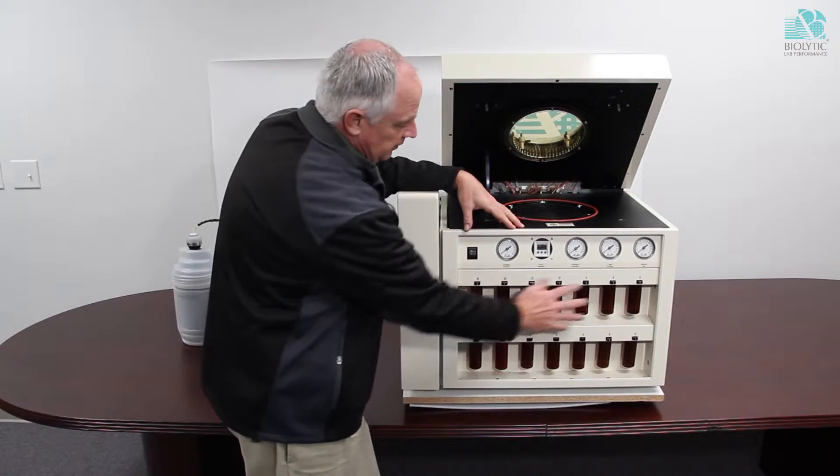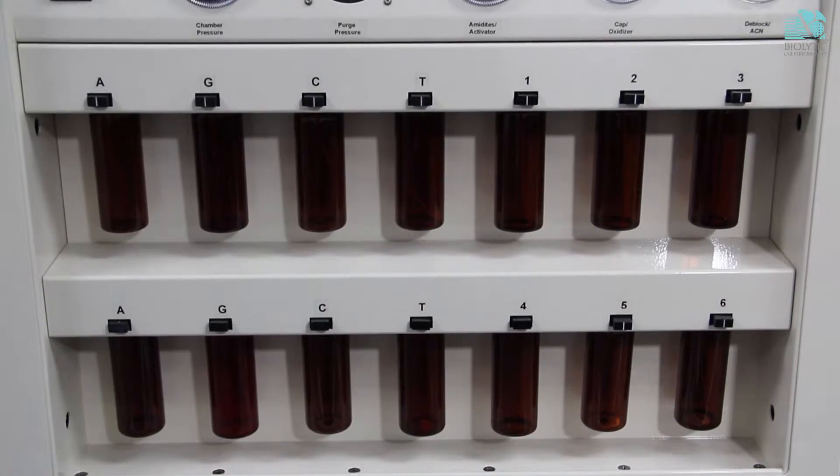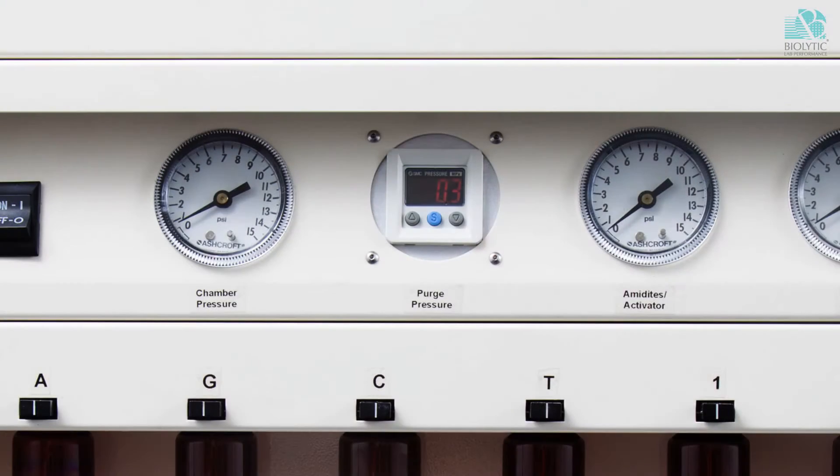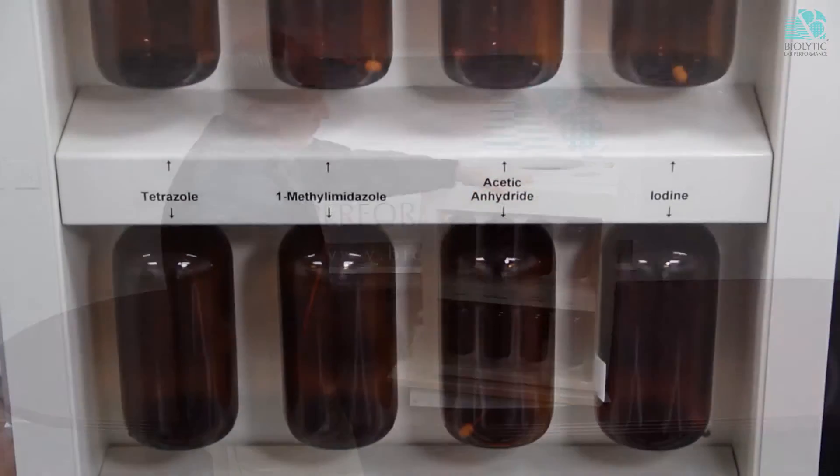On the front you can still see all of the aminite bottles are as they were. We've changed this analog gauge over to a digital gauge. These bottles remain the same as before.